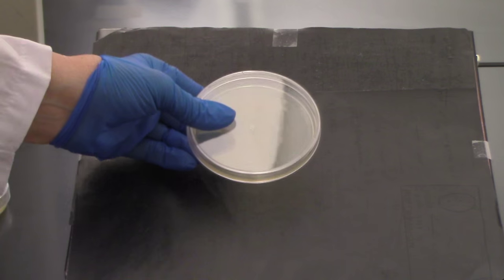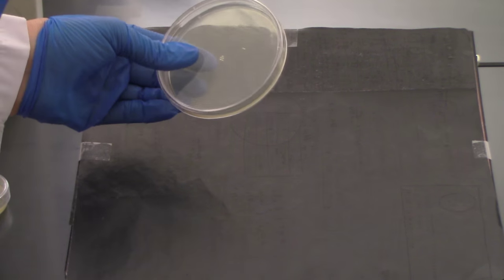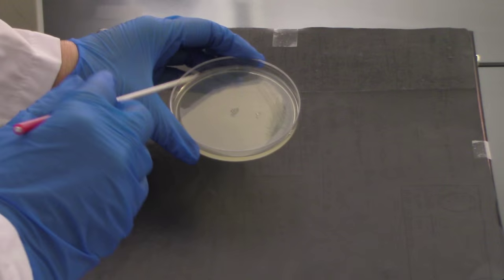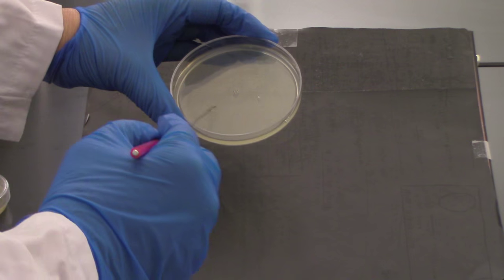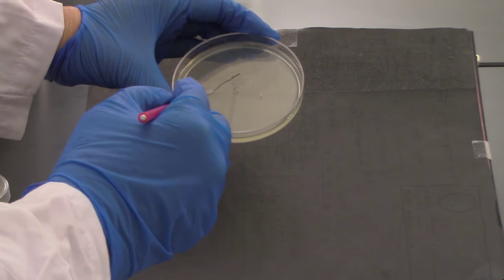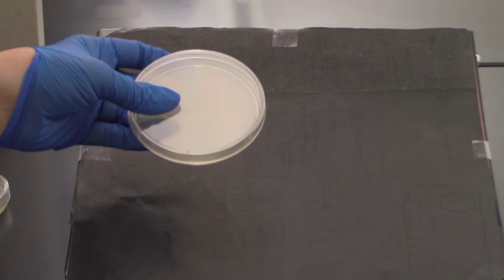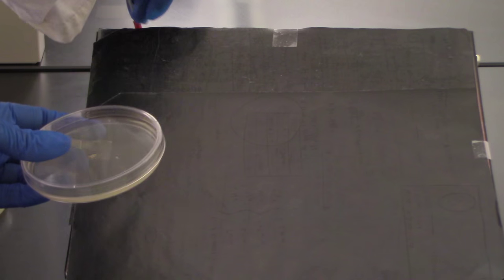I'm going to sterilize the loop again and let it cool. Okay, it's been 30 seconds. I'm going to do my last zigzag. As I do this one, remember I'm going to spread out the zigzag almost like a fishtail pattern as I get towards the end. I'm going to go back through my last zigzag several times and as I move out I'm going to spread that out to try to thin out the bacteria. Then finally I would sterilize this loop and let it cool.